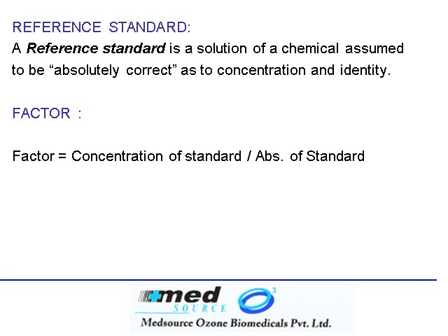Let's go back to the example of the ink that we discussed during the Beer-Lambert's law. We discussed that 5 drops of ink in 1 glass of water will produce a light blue color, and 20 drops of ink in 1 glass of water will produce a darker blue color. We also discussed that a spectrophotometer can measure absorbance, and absorbance is nothing but color. So a spectrophotometer is also a colorimeter which measures the amount of color.